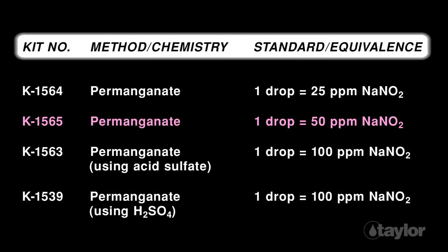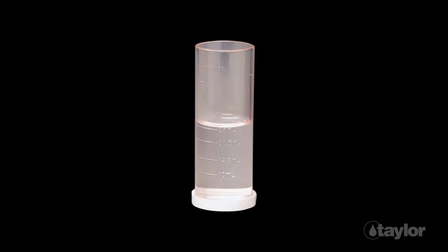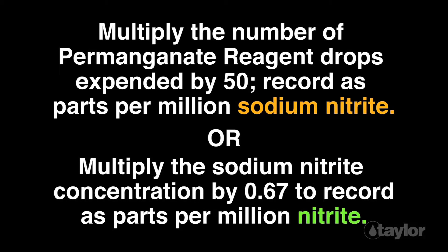Taylor offers four nitrite tests that employ the permanganate method, differentiated by drop equivalency and, in one instance, by the pH modifier used. In this video we are demonstrating the K1565. No color matching is required for this simple drop count titration — when the water sample goes from colorless to a permanent pink, the endpoint has been reached. The drop equivalency in the K1565 is one drop equals 50 parts per million as sodium nitrite. You can also record your results as nitrite by multiplying the sodium nitrite concentration by 0.67.